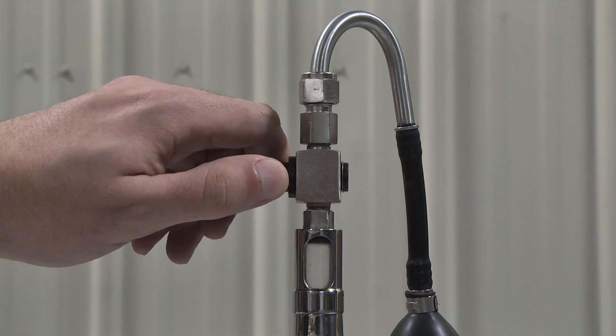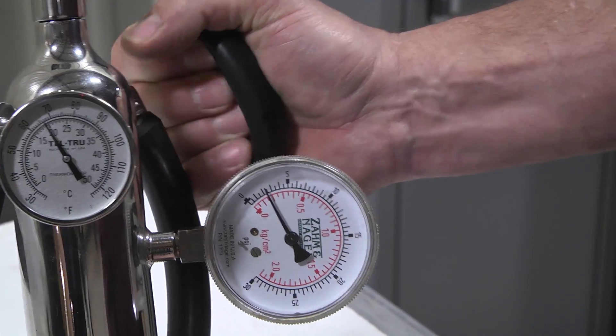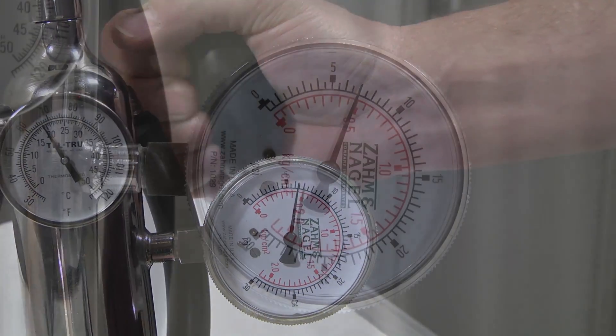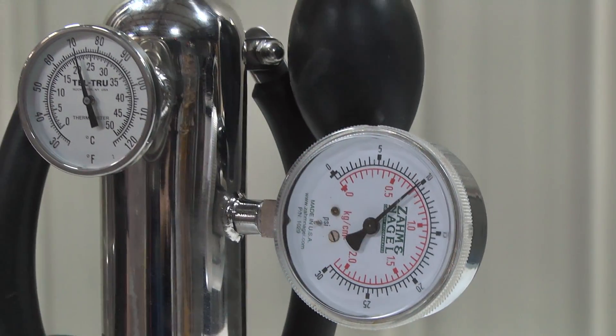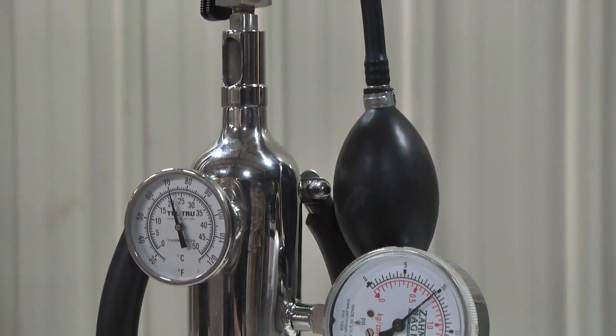Open the top vent valve and establish counter pressure with the aspirator bulb up to the approximate counter pressure plus hydrostatic head pressure existing in the tank to be sampled.